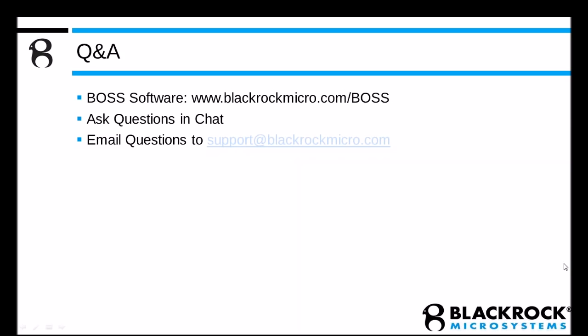The question is, can it process NEV files? Yeah, of course. BOS can open neural event files from Blackrock and load all of the spike data. Like I mentioned during the software demonstration, if you loaded a spike data file, such as a .nev, you would end up at the sorting screen. And that would be your launching off point, and you'd begin sorting from there.